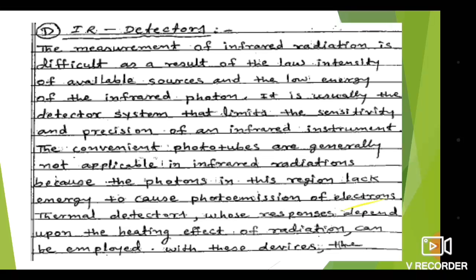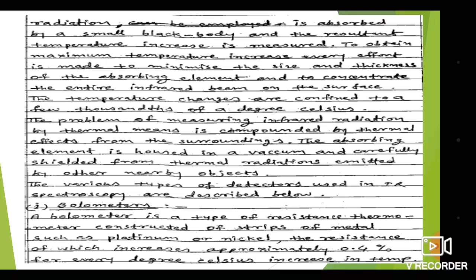With these devices, the radiation is absorbed by a small black body and the resultant temperature increase is measured by means of the detector.